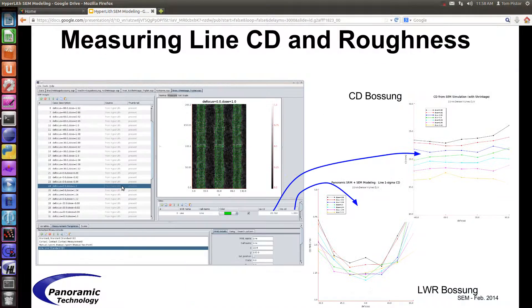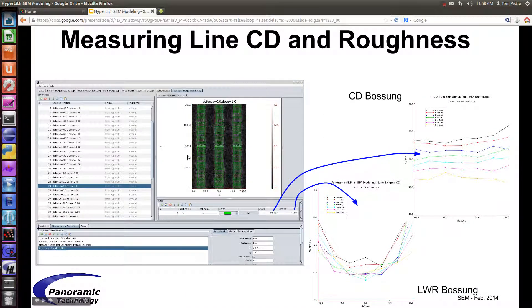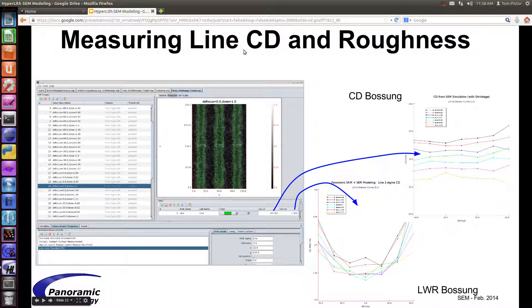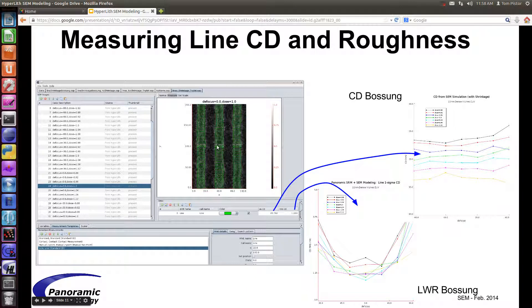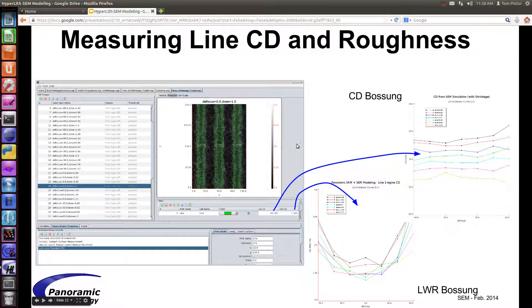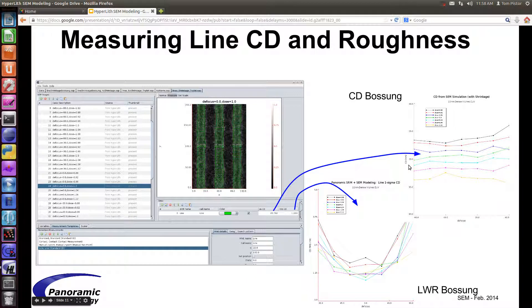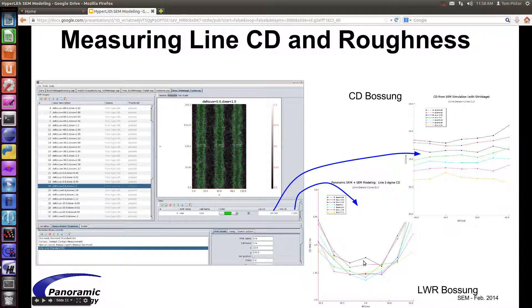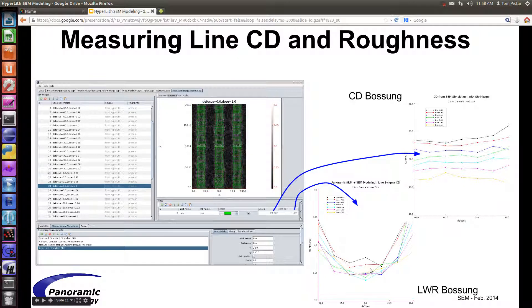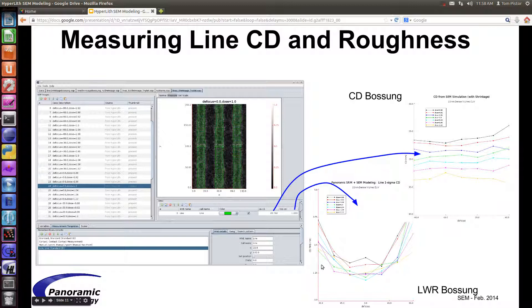Here's an example. In this case, we're measuring the line roughness. So the SEM image comes in, and you can place these measurements here, and it goes and measures the line at several places. And you can produce a CD Bossung here. That's CD versus focus for different doses. Or, in this case, this is a roughness, or a LWR line width roughness Bossung, the one sigma LWR, versus focus and versus dose.